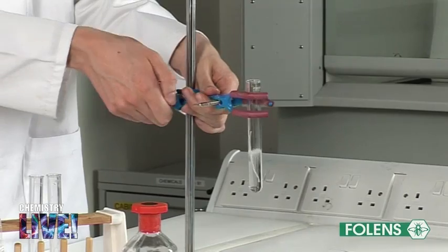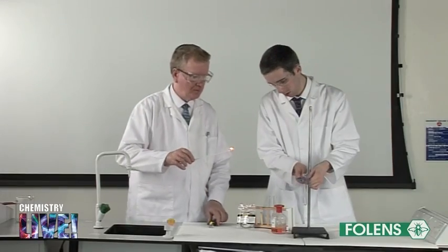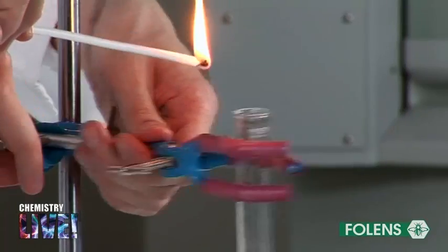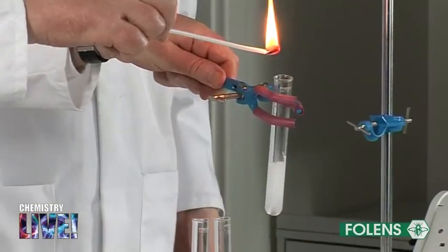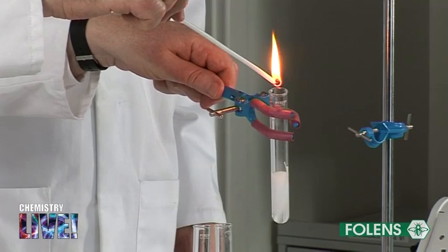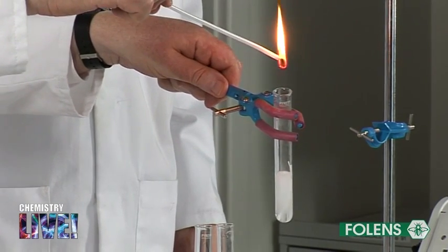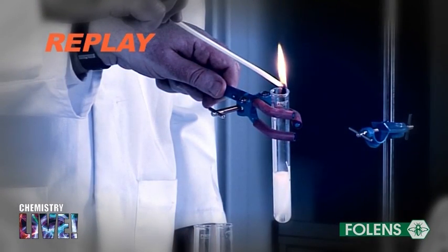Note that fizzing takes place. A lighted taper is brought near the mouth of the test tube. Note that a mild popping sound is heard.